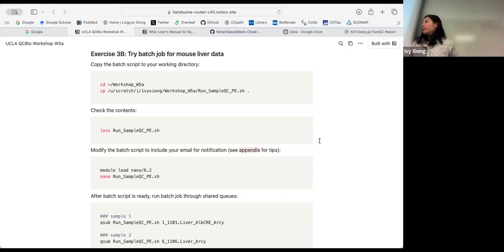I got two emails saying the job was complete. Okay, yeah. The output is still going to be on the cluster, so the email is just a notification. So we're going to go back and then we can see the content. Right, so it looks right. And probably we need to be curious what exactly it did.